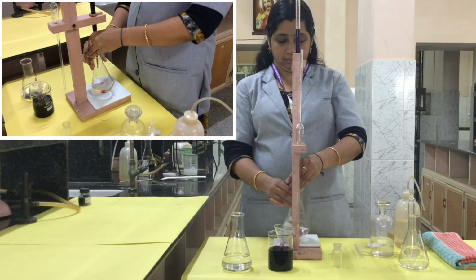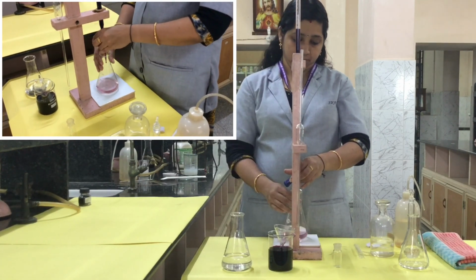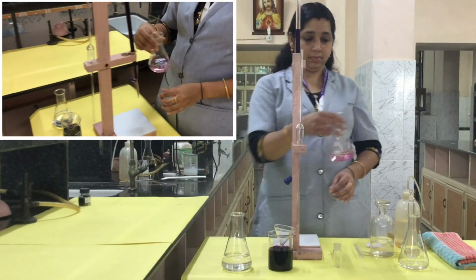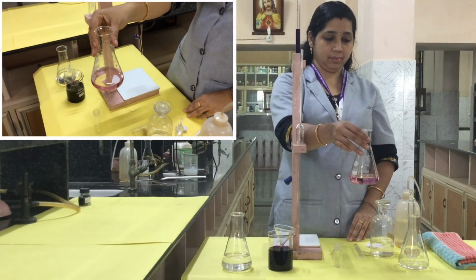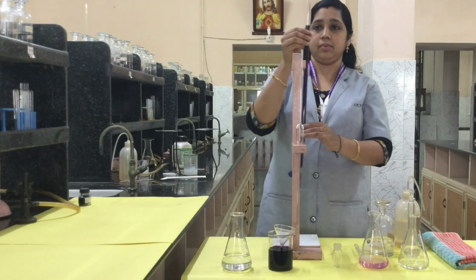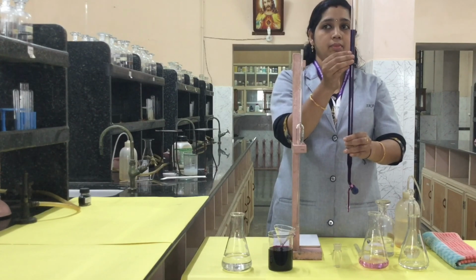Yes, just observe the change, children. You can see the color change from colorless to pink color. A slight pink color is obtained. That is the end point. You can see one drop can change that color. So slowly add the contents into the conical flask. You got the end point, the color changes from colorless to pink.